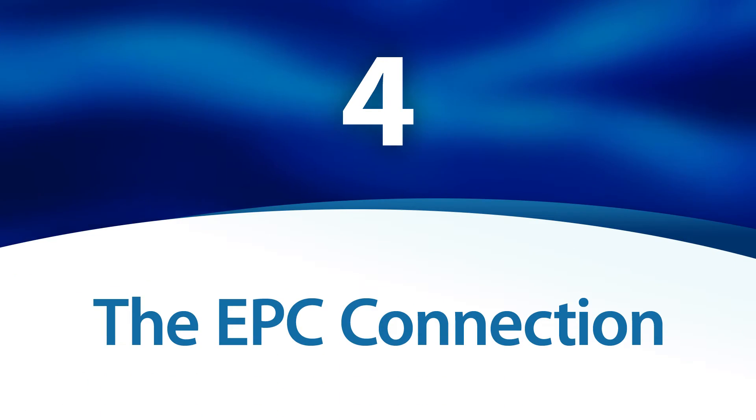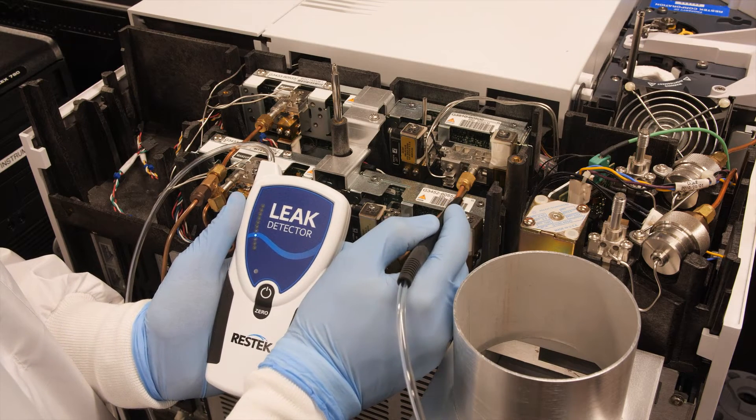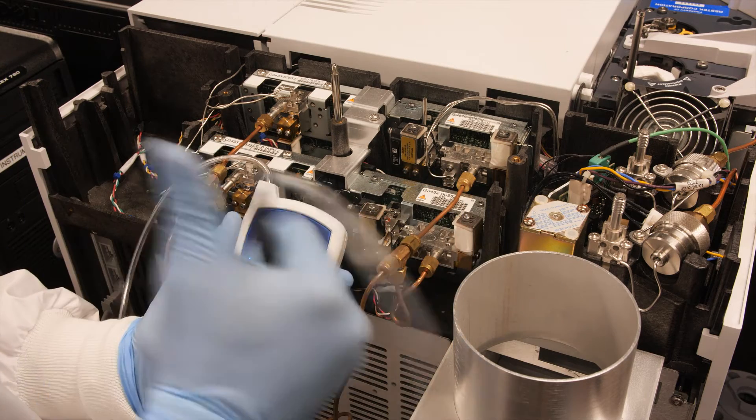The EPC connection. All gases enter the GC through the EPC, so it's a critical spot to check for leaks. If you find a leak, ensure all the connections into the GC are clean and secure.